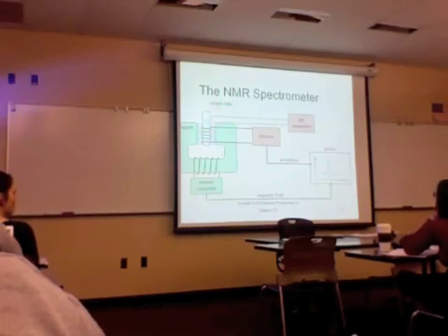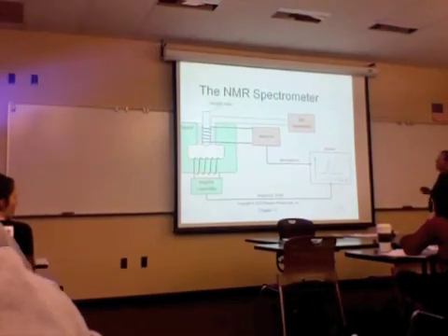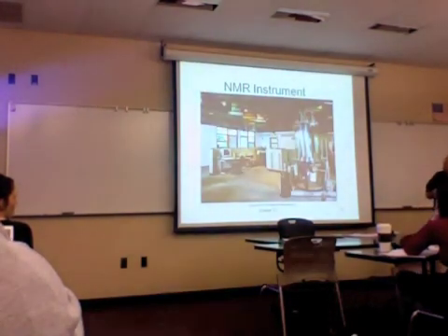In general, the stronger the applied magnetic field, the more resolution we'll have in seeing the changes. That's why the big instruments with bigger magnets are more expensive and more useful. This is a big NMR system.